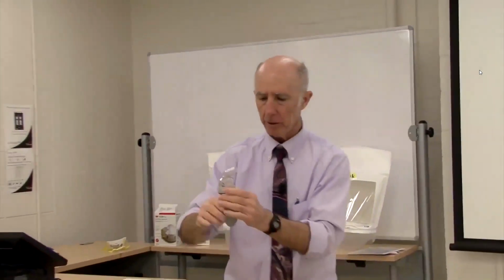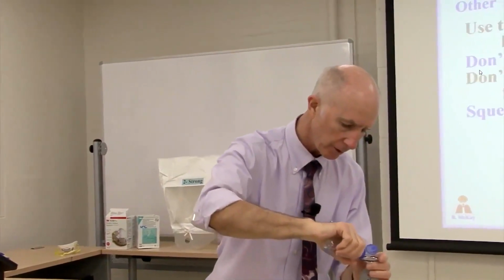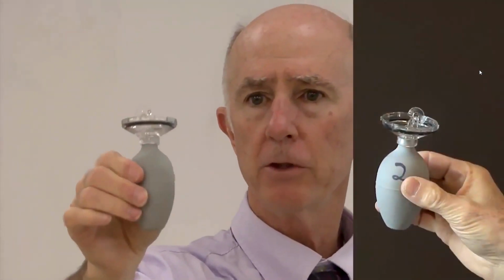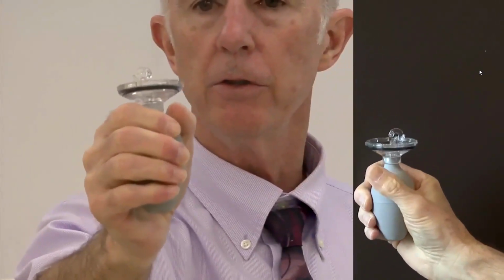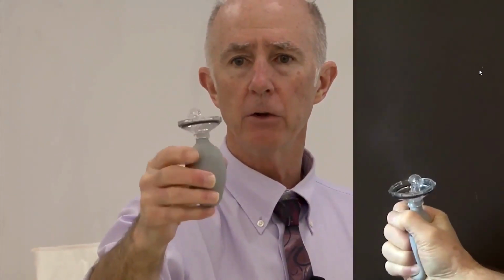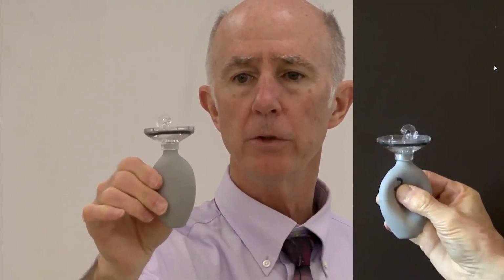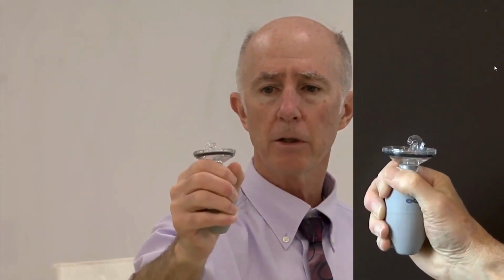Let me show you by removing the top. We'll put a little bit more liquid in here. So watch what happens if I just slowly squeeze it with my fingertips. You probably don't see anything coming out. Now, if I squeeze it with my palm, you might be able to see a large amount of aerosol coming out. Again, I'll go with my fingertips. If you use your fingertips, don't squeeze it completely. Essentially nothing comes out. Squeeze it, completely compress it, allow it to completely expand before the next squeeze.